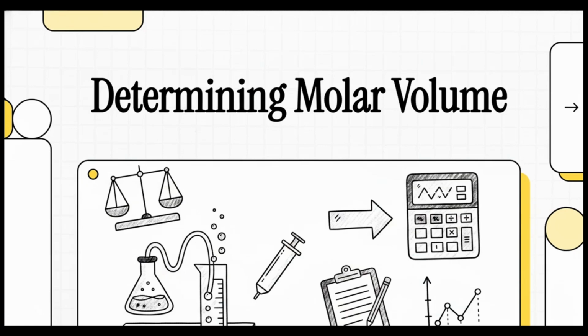All right, if you're taking Edexcel AS Chemistry, you know exactly why we're here today. We are tackling one of the absolute most common, high-stakes practicals in Paper 3, determining the molar volume of a gas. I am incredibly excited to guide you through this explainer because we aren't just going to talk about what to do at the lab bench. We are going to look at exactly how to translate that messy lab work into guaranteed, rock-solid exam marks.